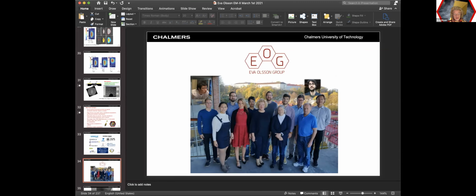We are actually working now on zeolites, and what we see there is that we do have an effect of the electron beam. So we are starting with quantifying the effect of the electron beam and also how it relates to the electron beam dose and dose rate. We are also exploring the use of graphene, because there are some reports in the literature where graphene can actually reduce the effect of the electron beam. And we want to understand if it does reduce the effect and also why.